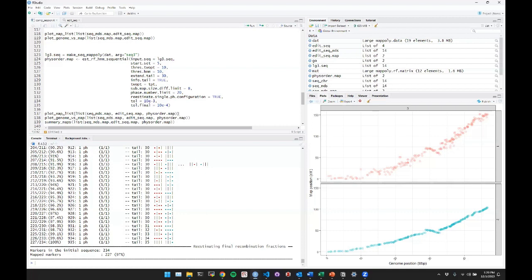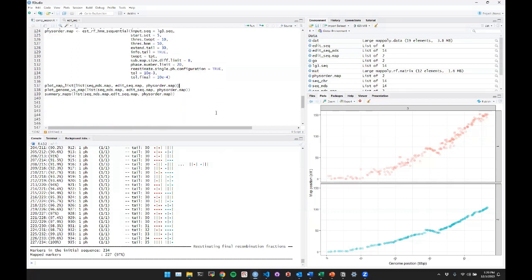We have Old Blush that is being used to develop the two assemblies that we have for Rosa chinensis. It's not really a true chinensis, but that's what they call it. And we can do some tests to see whether those inversions are real or not, but that would require additional work that we haven't done yet.